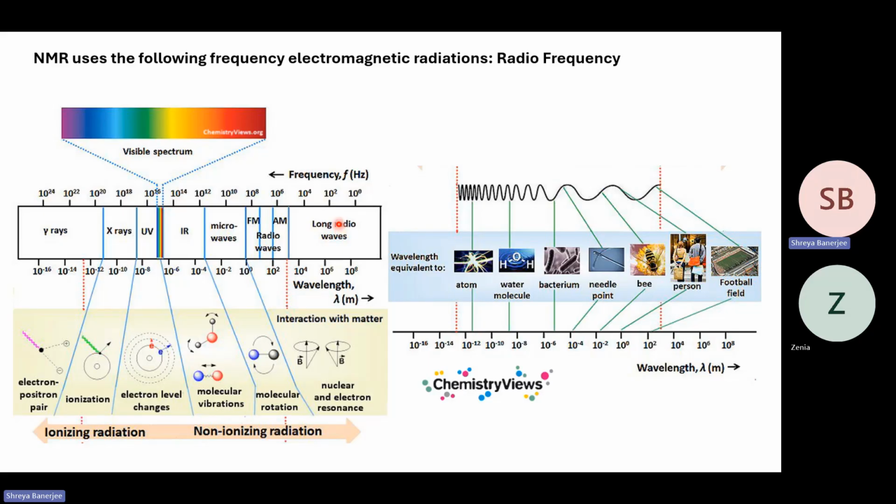So you can take NMR once, then you can use the sample for something else, or you can take NMR under different circumstances. The compound does not get destroyed by NMR since the radio frequency has very low energy. In comparison, while doing X-ray crystallography, X-rays have much higher energy, so sometimes they can destroy the compound. So that is one advantage of NMR over X-ray crystallography or other techniques.